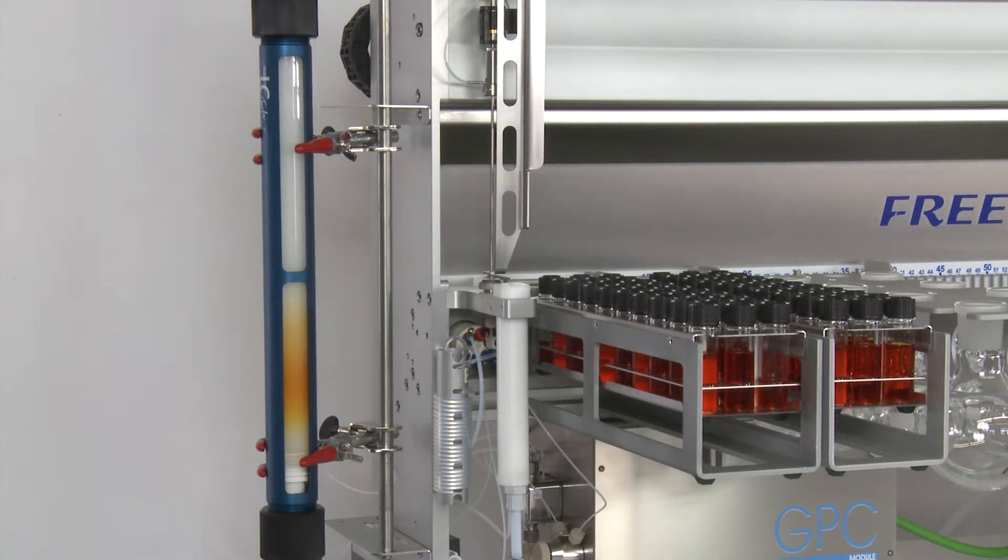Thereafter, it will be chromatographically cleaned, and interfering matrix constituents, for example fats, will be removed.